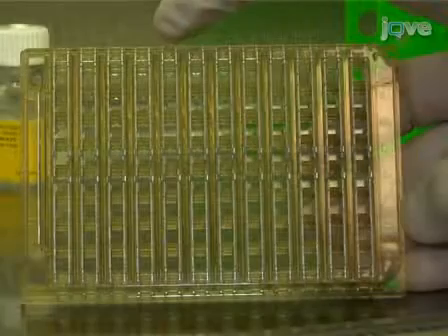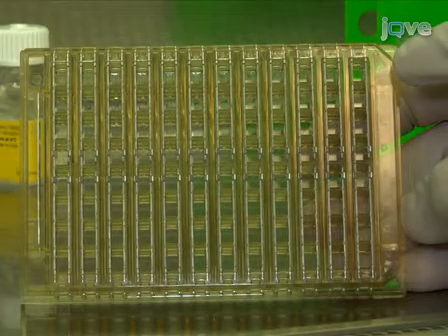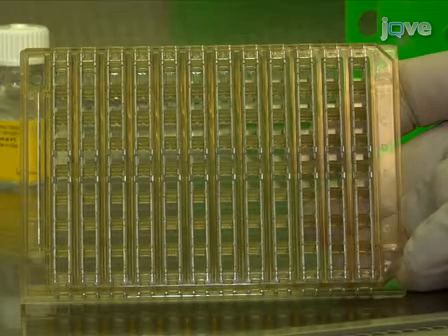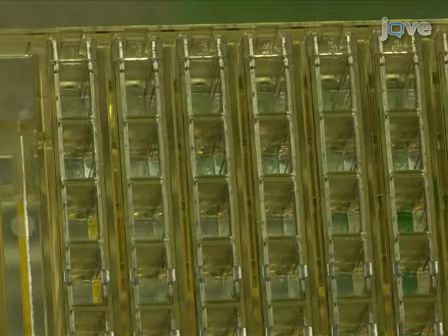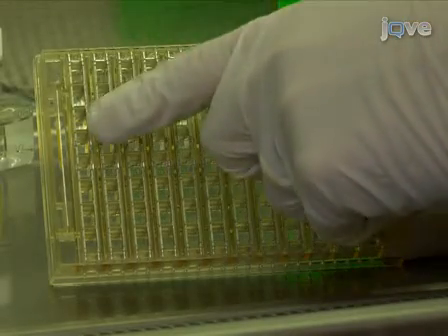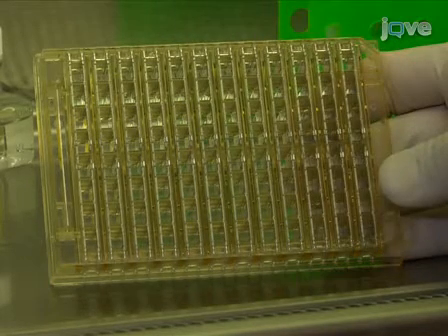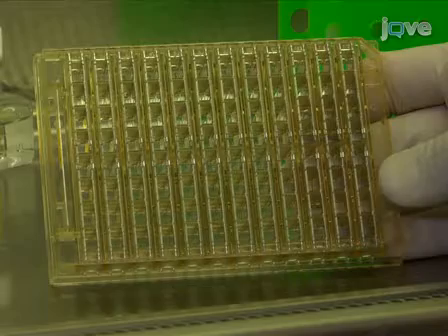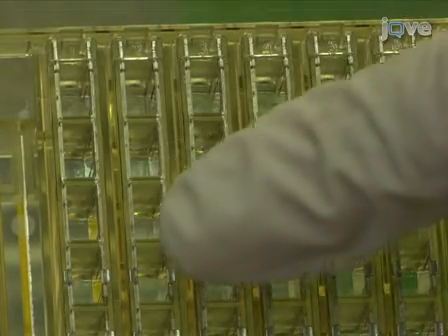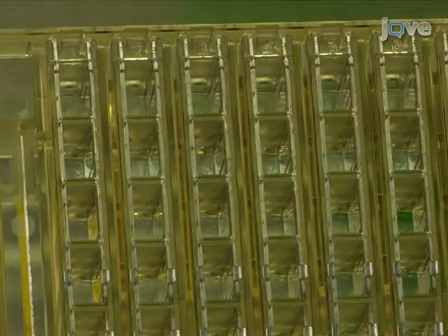The plates are divided up into 96 wells, with columns labeled 1 to 12 and rows A to H. Each set of four wells, or well set, shares a pair of electrode plates, so the cells in those wells experience the same pulse. For example, cells 1A, 1B, 1C, and 1D are electrically connected in a single well set, and would all receive the same pulse. The next set of four wells, 2A, B, C, and D, would all receive the second pulse when the protocol is initiated, even though the parameters may be the same.